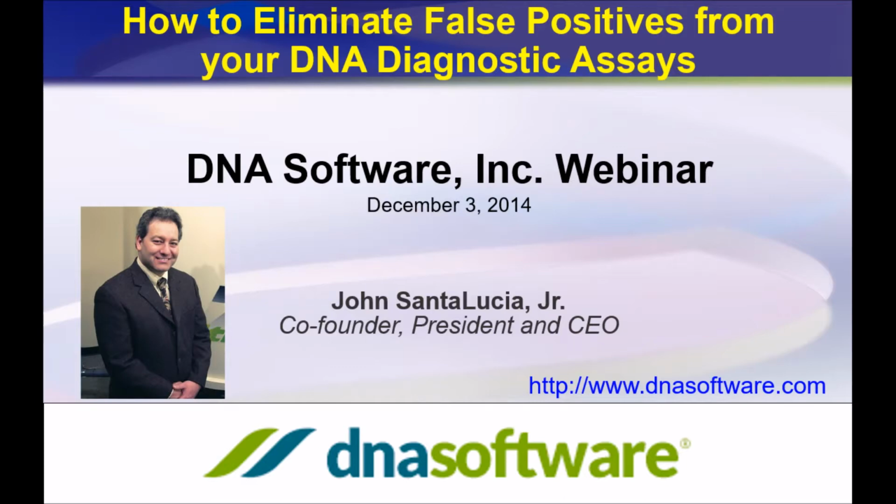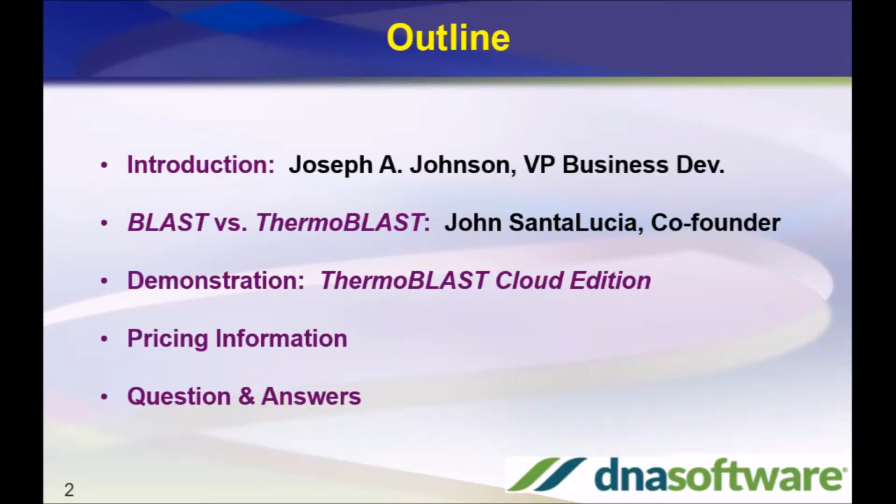I'll introduce John Santalucia, our CEO and co-founder. We'll go through a brief demonstration of the product ThermoBLAST Cloud Edition. We'll discuss some basic pricing information and have a Q&A session at the end of the webinar.